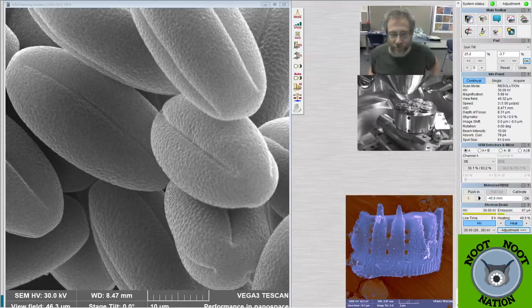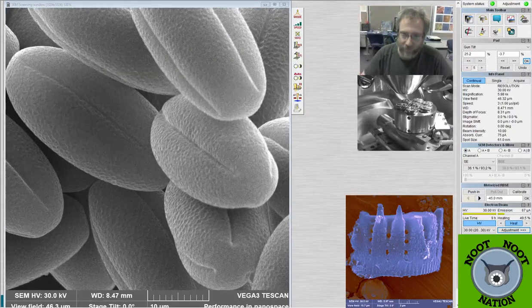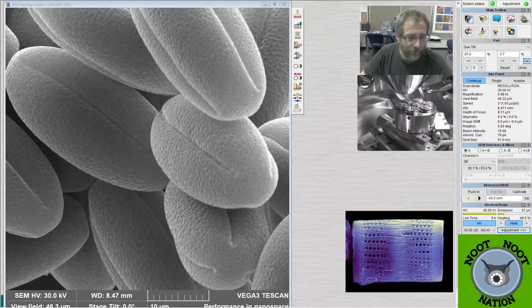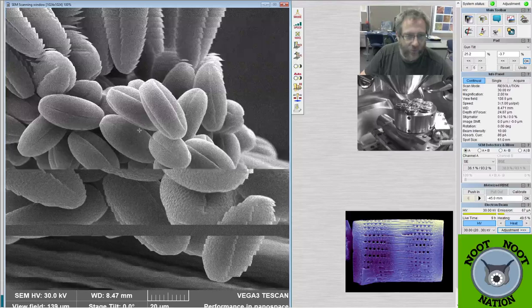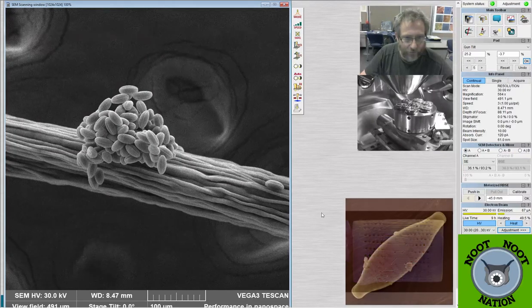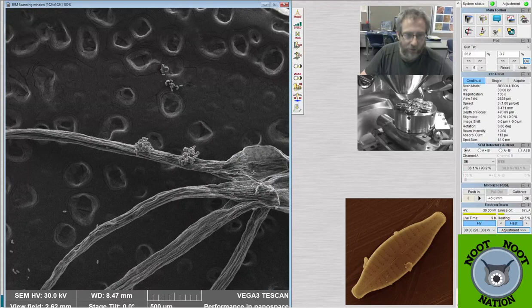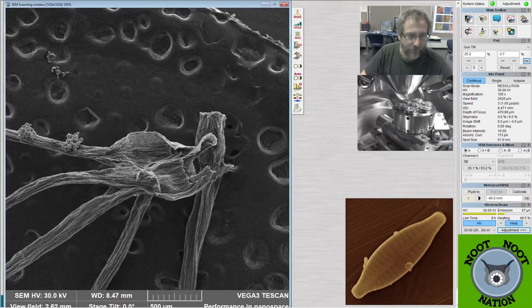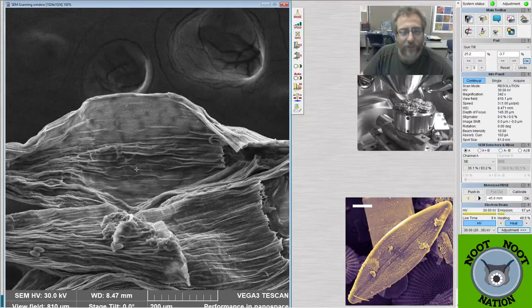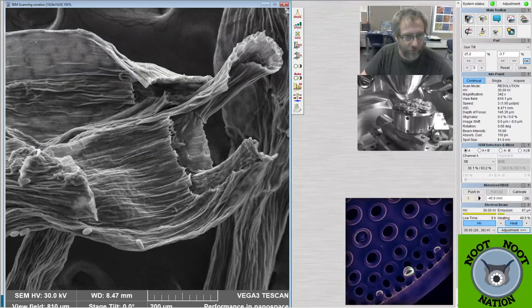From the beginning to the end of that process is maybe about an hour of me collecting and then subsampling them. And so right now we're actually looking at the redbud pollen. And if I zoom out, you can see there's a whole cluster of them right here. And they're on a little piece of the plant, which you can see running across the SEM. And if I keep zooming out, these are part of the flower petals right here. So they're a little shrunken, and that's because everything inside the SEM is happening in a vacuum. And the vacuum also tends to pull all the water out of the material that's in there. The pollen are pretty resistant, so they don't usually shrink very much.